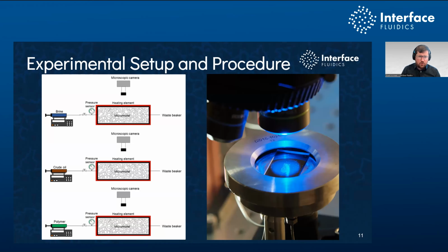And so the question is, how do you run a microfluidic experiment to do EOR experiments? What you can see on the right there is a close-up image of one of our devices. You can see we've got the microfluidic device inside of a manifold that holds that device. And on the left side is a schematic of the system. So the way we run these experiments is first we saturate the porous media with brine from the reservoir.